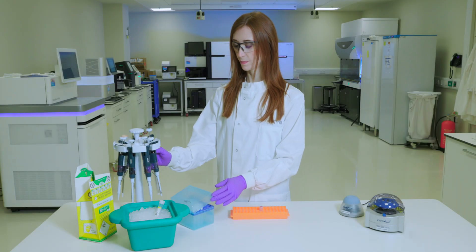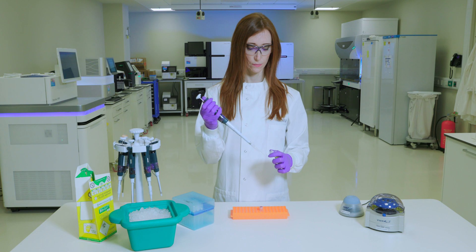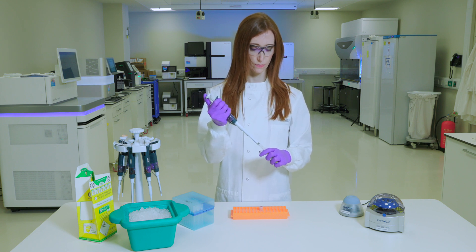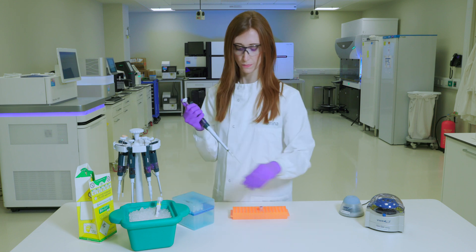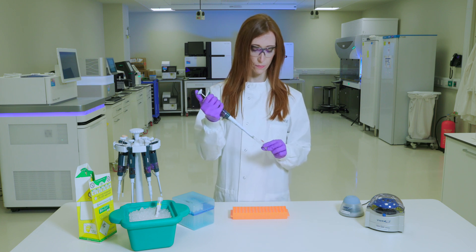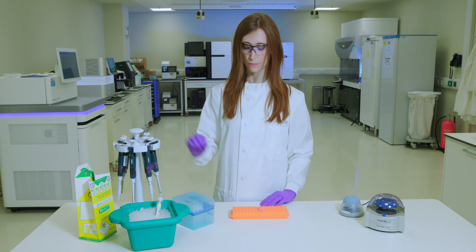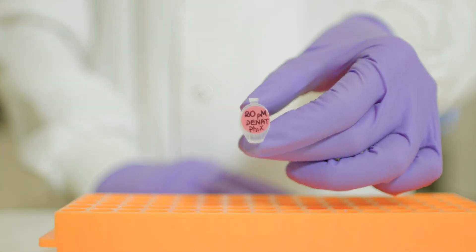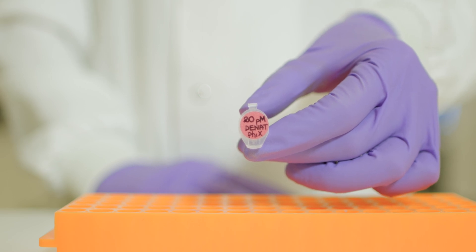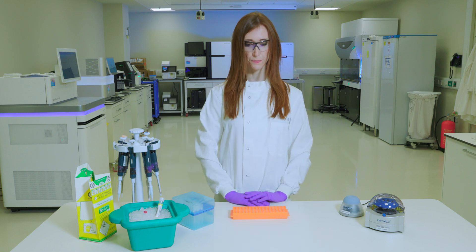To dilute the denatured PhiX library, add 990 microliters of pre-chilled HT1 to the tube containing the library, then invert to mix. This will result in 1 milliliter of 20 picomolar denatured PhiX library. You can store the denatured 20 picomolar PhiX library for up to 3 weeks at minus 15 to minus 25 degrees Celsius.